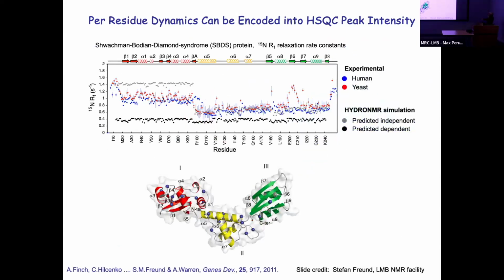Here's a real case example. It is looking at a 3-domain protein of clinical significance. It is isolated from cancer patients. In this particular case, we can see from the relaxation plot, one domain, which is the red one here, is rotating at a different rate to the other two, which rotate together. So there's intrinsic flexibility in that link, and mutations in that region are connected to clinical manifestations.